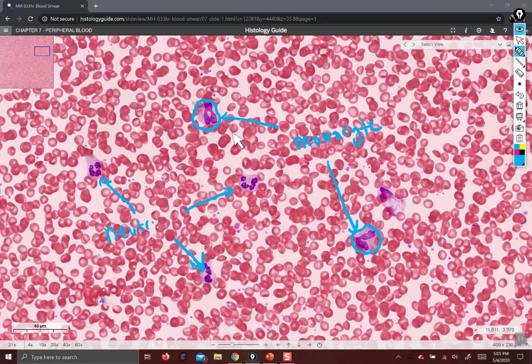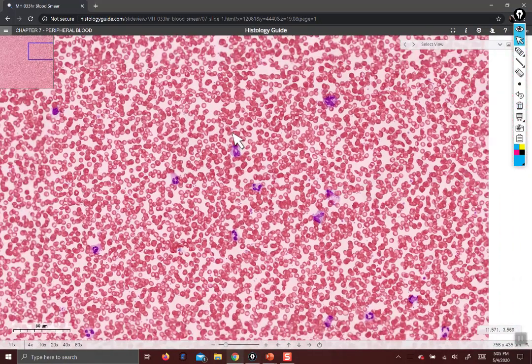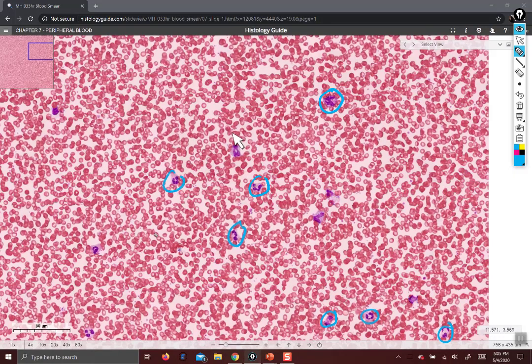These are neutrophils. And then this is a damaged cell — question mark — it might be a damaged monocyte, we can't be sure. Oh, here's a basophil. Basophil, neutrophil, neutrophil, eosinophil, neutrophil, neutrophil, neutrophil, lymphocyte, weird neutrophil, neutrophil.